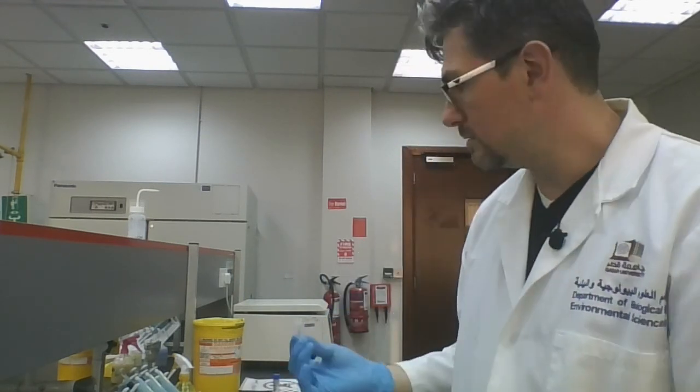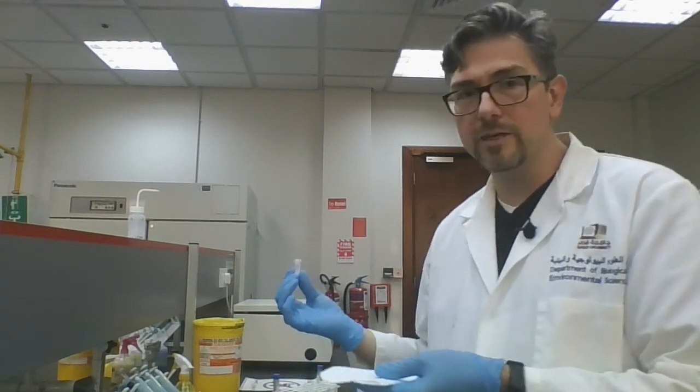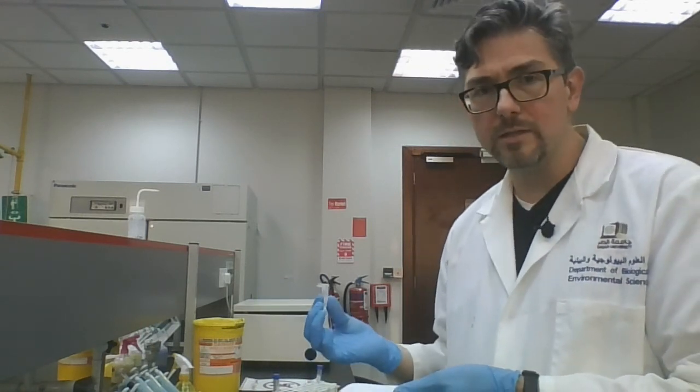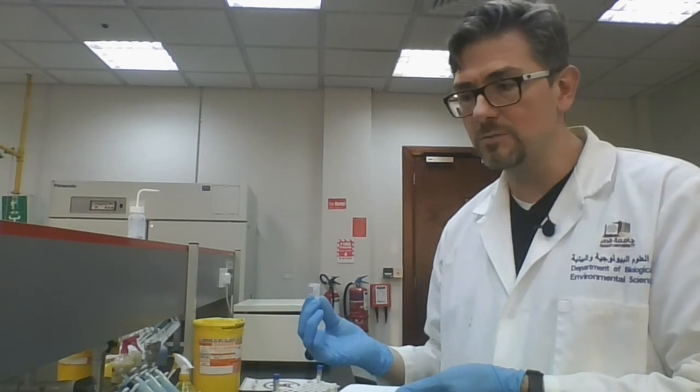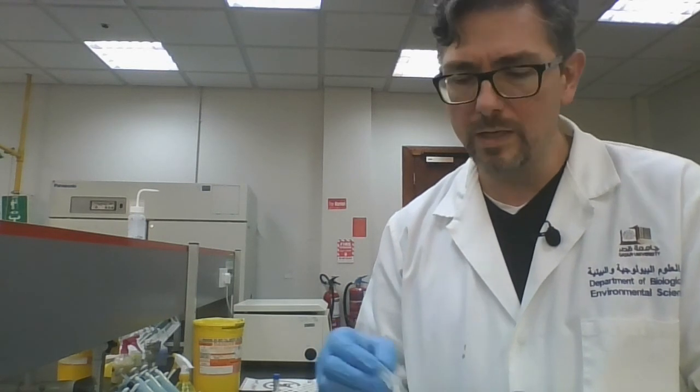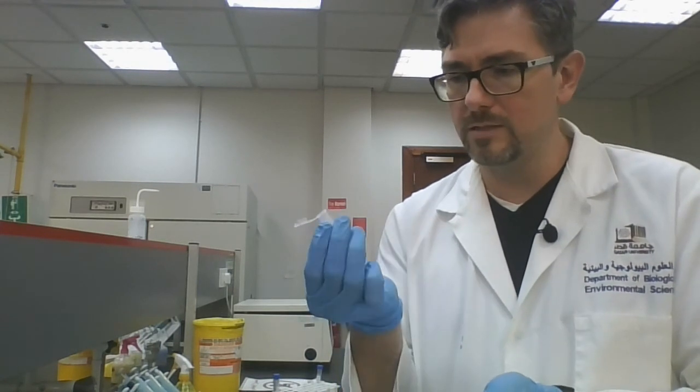Then you're going to add the TE or TER, that's the final solution in which your sample will be stored, and you're finished. The sample with the TER, with the RNase, is also going to be incubated for 30 minutes at 37 degrees Celsius, just to allow the RNase to do its job before we store it. Once you have added the solutions to your pellets, they will dissolve fairly easily, okay? And at that point, just leave the samples on your bench. We will collect them and place them into the appropriate places as necessary.